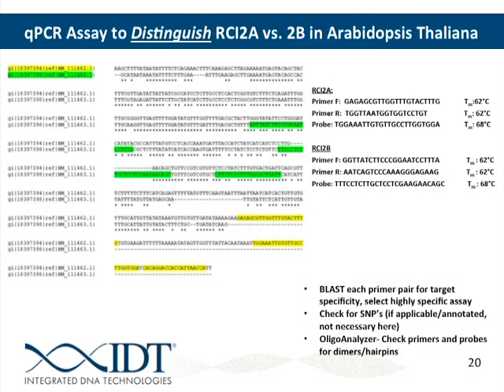Well, the bases you have... the TM of your probe. Because if you end up making a two lower TM of your probe just to avoid two or three bases on the terminal, you may end up compromising that assay. Just remember that even if on this two or three, the majority of that sequence won't sit down on a mismatched target. So it's not going to pick up. Yeah, especially since a single mismatch can affect the TM up to 8 degrees. So if you count in, what is that, like 10 or 12 mismatches there, there's going to be a huge TM difference between those.